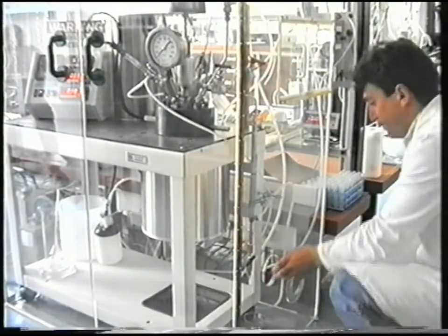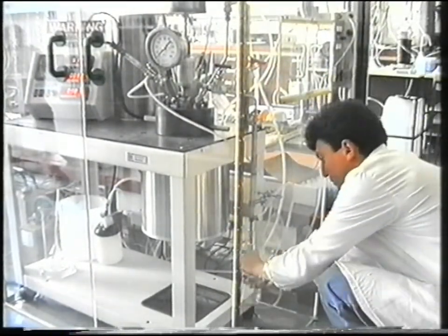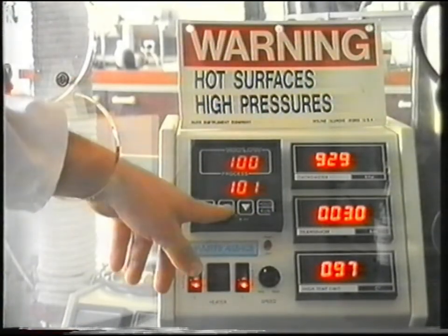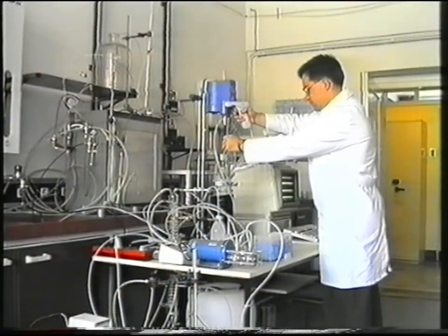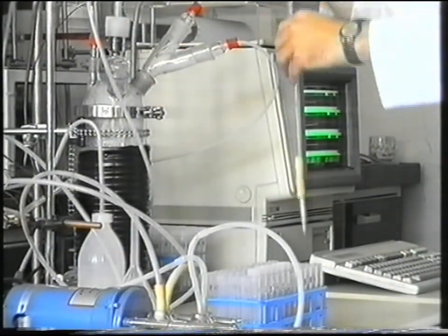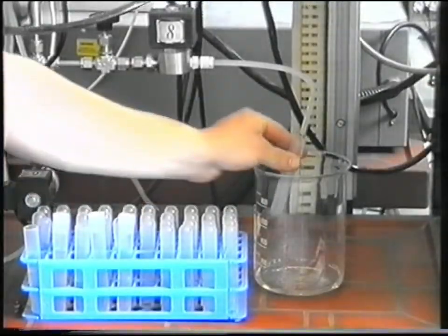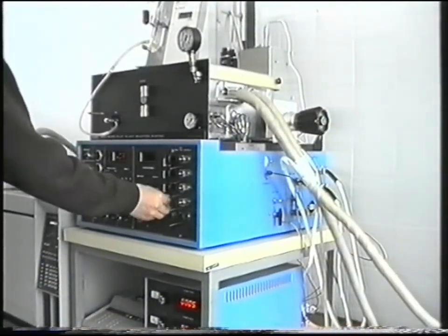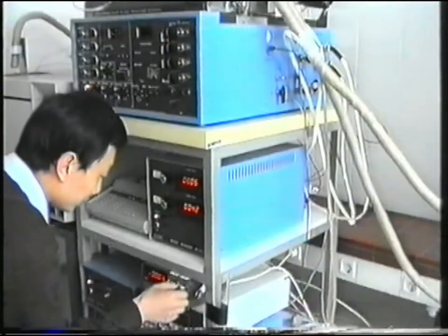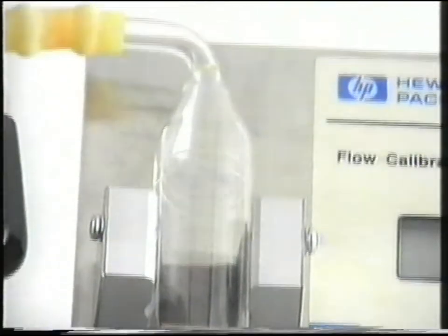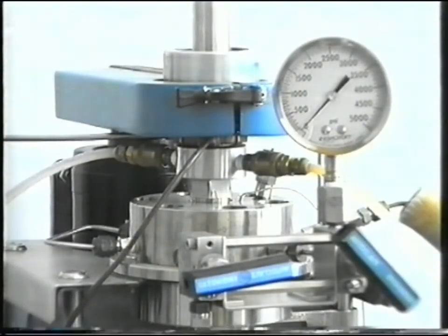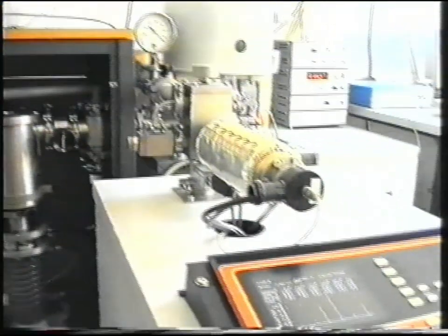The research activity of this laboratory comprises the kinetic evaluation of catalyzed and non-catalyzed chemical reactions running in homogeneous or heterogeneous reaction systems. The research team is capable of designing and synthesizing catalytically active substances, preparing catalysts, modeling chemical reactors for reactions within single or multiphase systems, and designing integrated process schemes for industrial catalytic processes. The interdisciplinary knowledge and broad experience of the research team in the fields of heterogeneous catalysis and chemical reactions engineering have resulted in the design and development of pilot-scale catalytic processes for the production of dimethyl ether from methanol and the catalytic wet oxidation of organic water pollutants.